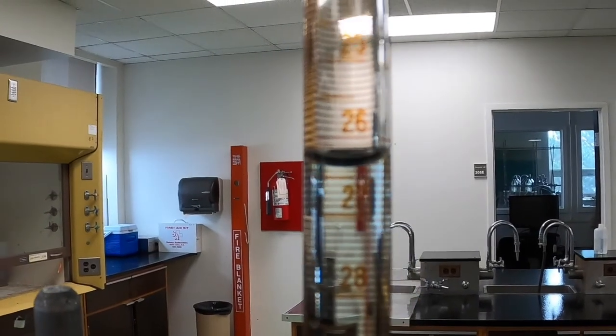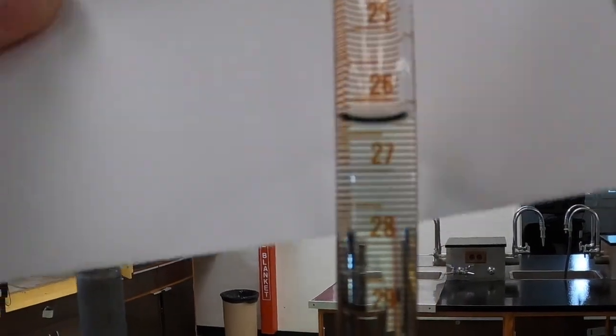It can also be helpful to hold a white card or a colored card behind the glassware to provide a bit of visual contrast to help you see the meniscus.